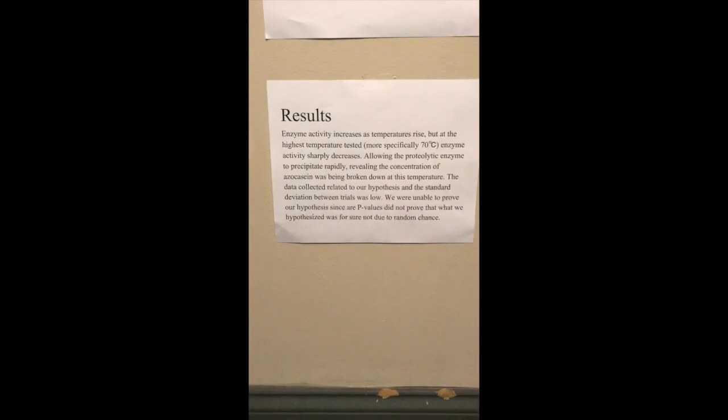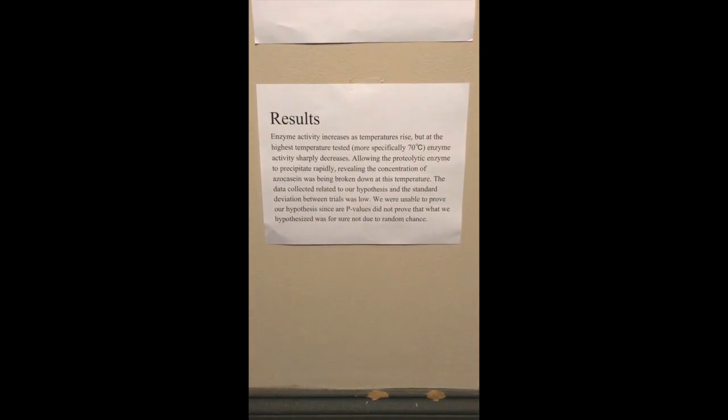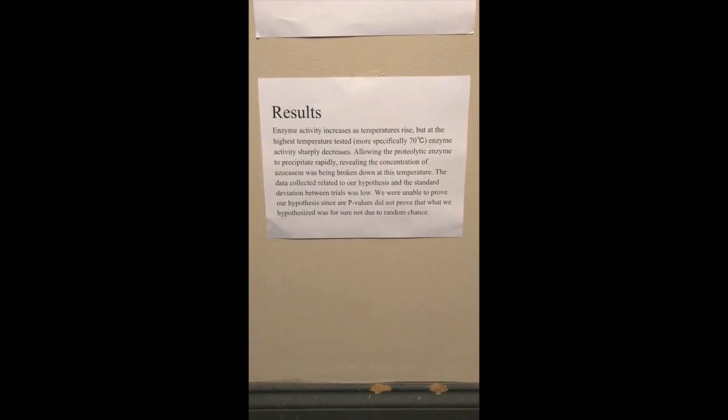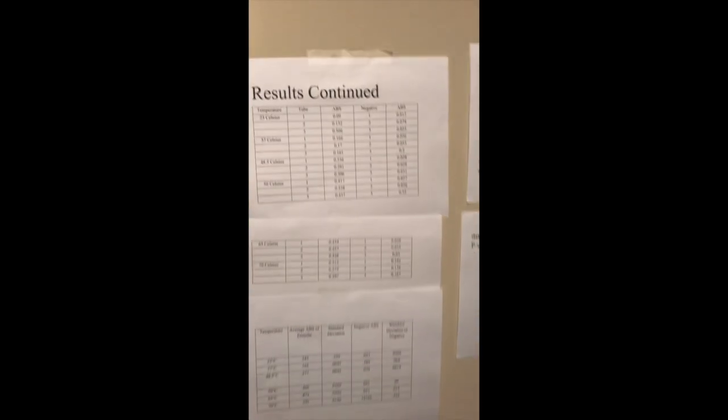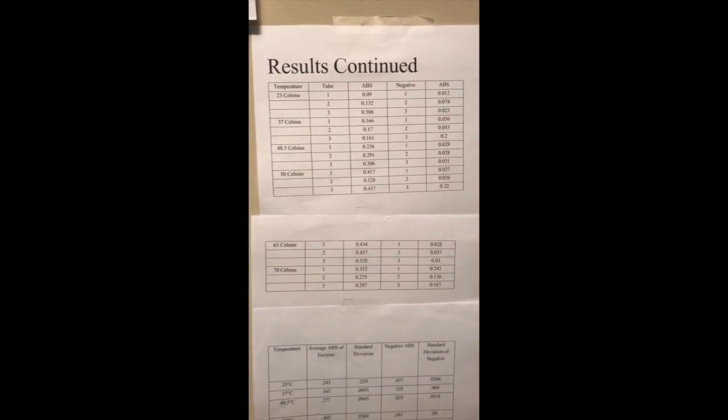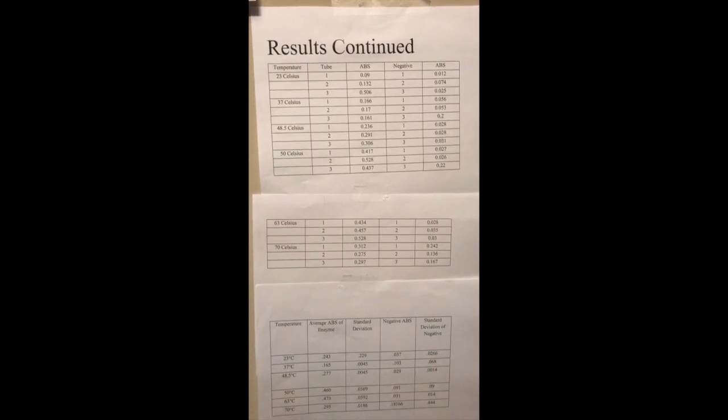Our results showed that enzyme activity did increase as temperature increased, but we are unable to prove our hypothesis since the p-values were not under 0.05. We recorded each of our test tubes for the positive and the negative controls. We had 3 for each, so we had 36 tubes overall, with half being the negative control. We then took their averages and their standard deviations.